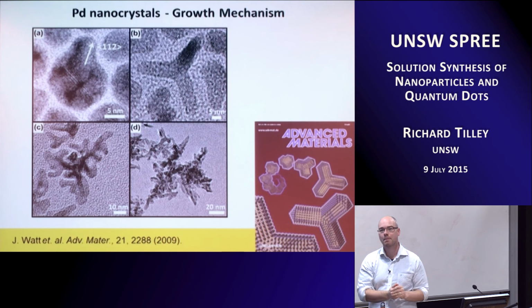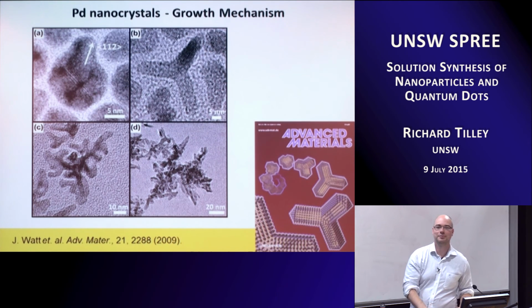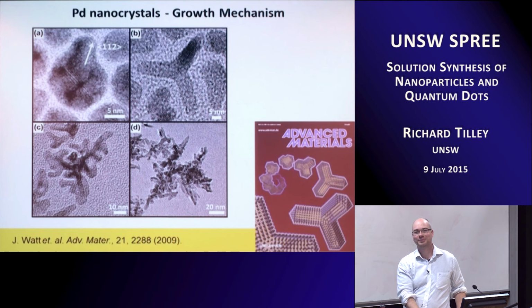Yeah. One more question on the synthesis. You've shown this method where you have a flask with the precursor solution and a hydrogen atmosphere, and then you use slow cooking, right? You just heat it up and you get a slow reaction. Though probably with hydrogen it's not quite benign. I guess that's what you meant when you said it's a bit reactive. It does help, yeah.